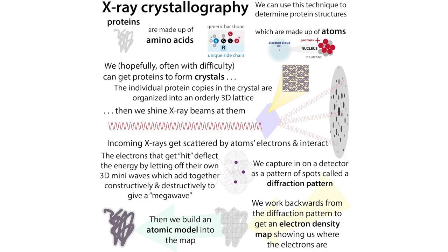X-ray crystallography is great for a lot of things, giving you really high resolution data for regions of a protein that are stable, for regions of a protein that are really sturdy. Because with X-ray crystallography, you have to actually get the protein to freeze on its own volition. So basically, you have to get all these copies of the protein to stop moving around and freeze in the same orientation. Then you shoot X-rays at them.